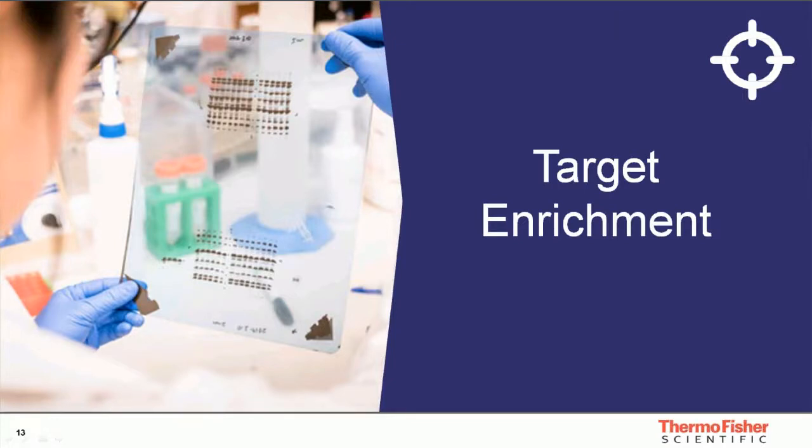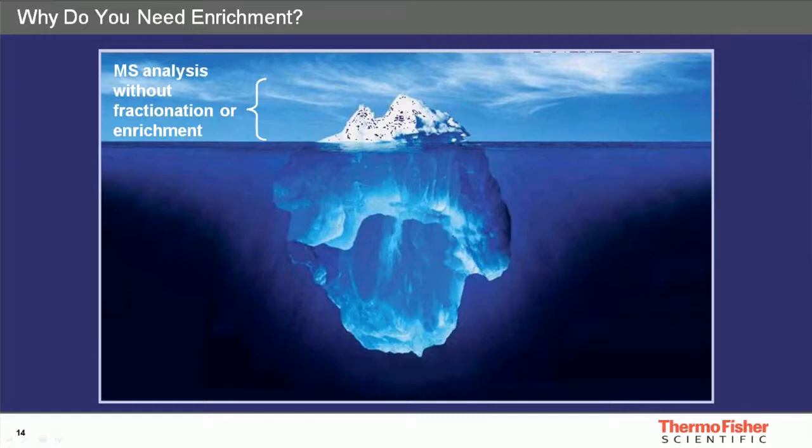We will talk about the sample prep improvements for the targeted mass spec applications. The first thing we want to talk about is target enrichment. Now, why do we need enrichment?